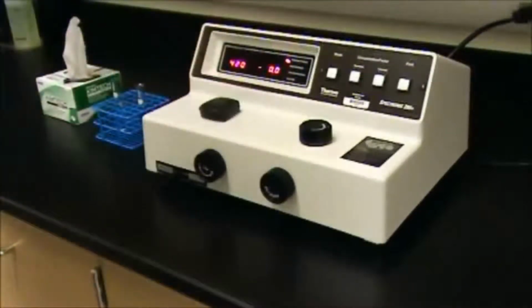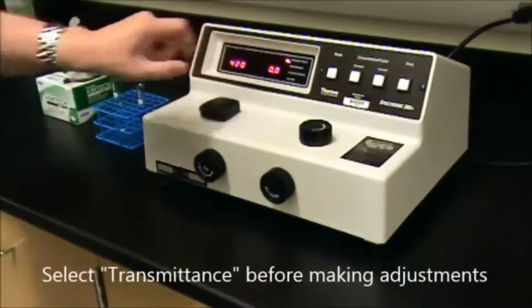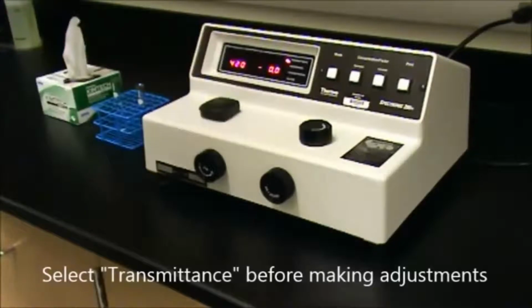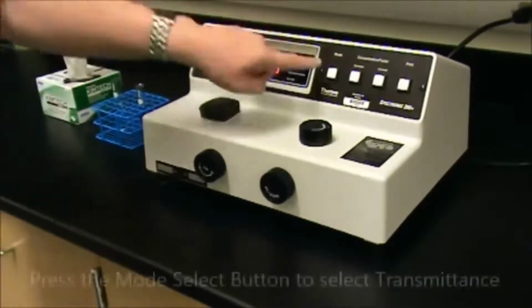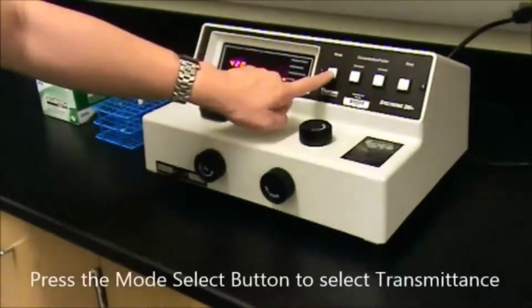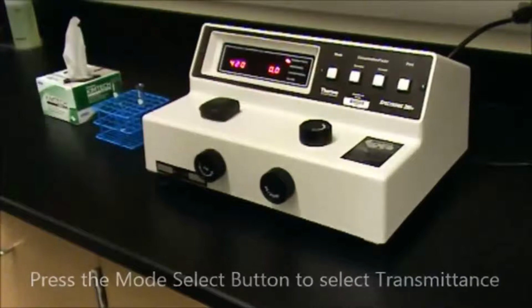When taking readings, it's best to use the transmittance as the way to set up the machine and also to take your readings. The transmittance scale is linear, so it's easy to set the 0 and the 100%. So when you're ready to calibrate the machine, be sure to push the mode button several times until you have the transmittance value highlighted before you begin.